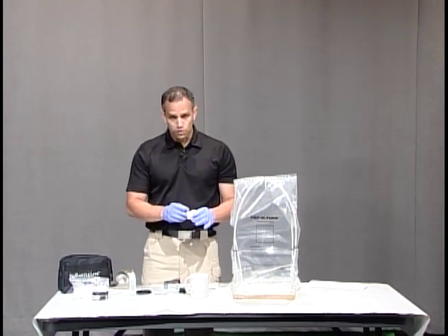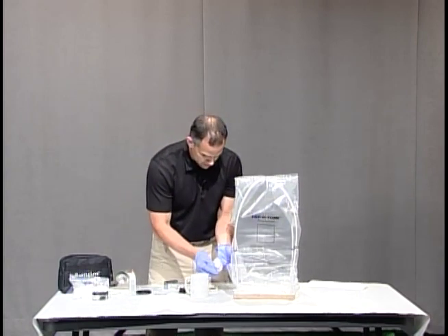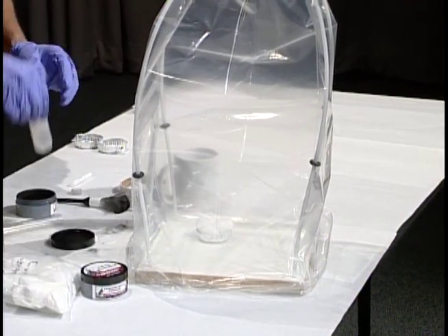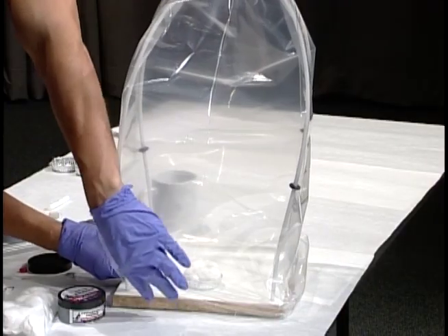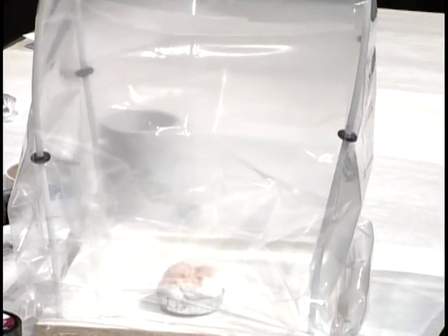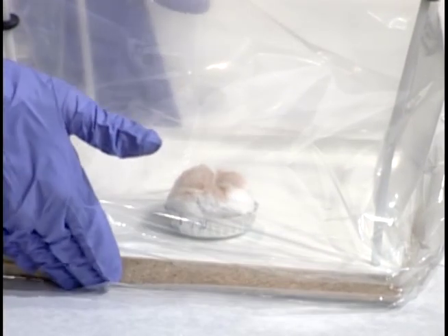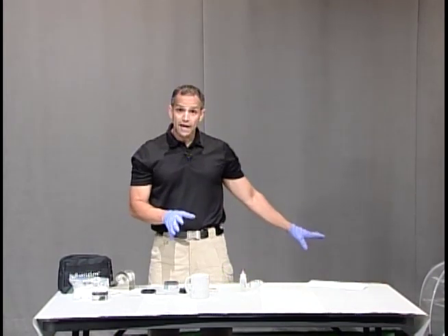Let me put this over here in the close-up. I'm going to add some super glue — I have the metal tray loaded with the treated cotton balls. We're going to squirt our super glue on there. Now you can see that fuming — beautiful. So we saw how fast that fumes, lots and lots of fumes. You have to be careful again with how quickly that's going to fume your items because you don't want to over fume. Also, you can include hot water in the portable chamber to really get that humidity up.